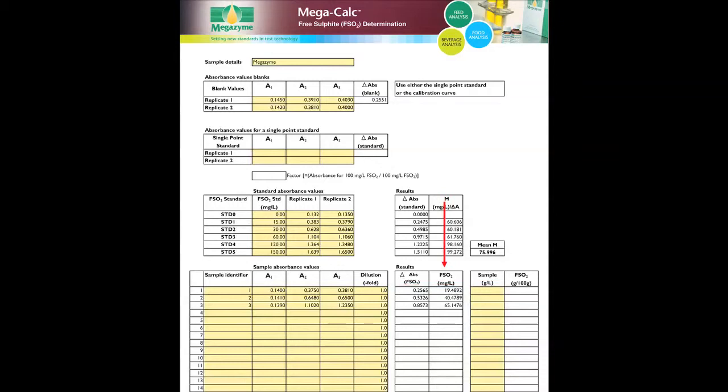For liquid samples, results are automatically calculated in milligrams per litre. For solid samples, enter the original concentration at which the solid sample was dissolved or extracted in grams per litre prior to analysis. Once all data has been entered into the spreadsheet, Megacalk automatically calculates results, which can then be printed or saved electronically.